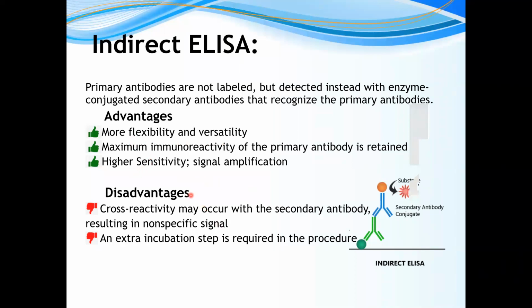Some of the disadvantages of this format are it shows cross-reactivity with the secondary antibody, which gives some non-specific signal or high background. It requires an extra incubation step in the procedure that can enhance the overall experimental time.